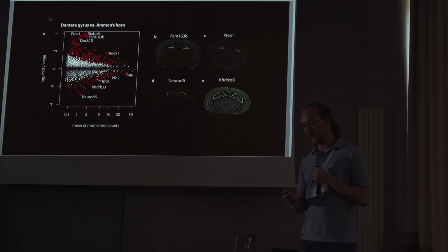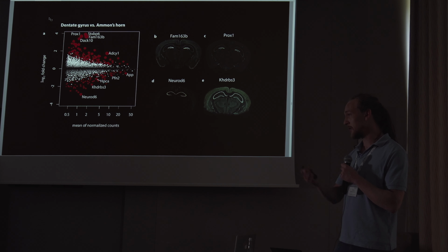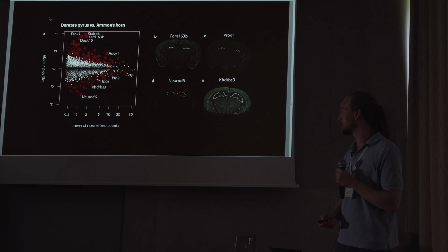So with this, I hope to convey that indeed, by modeling the data across many samples, we can identify the corresponding regions and then perform downstream analysis.